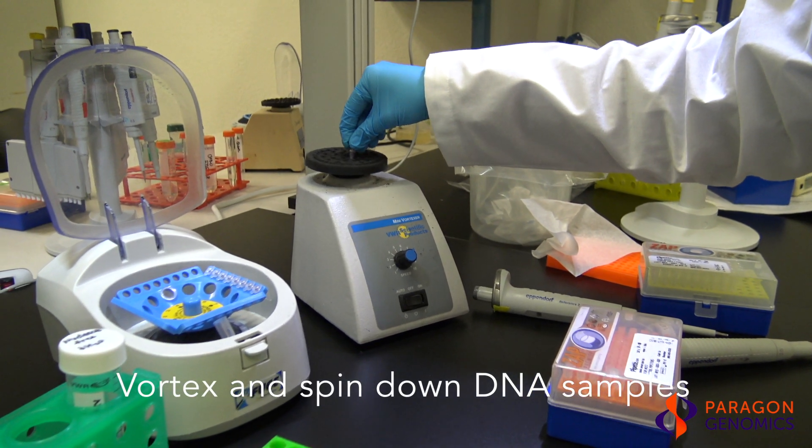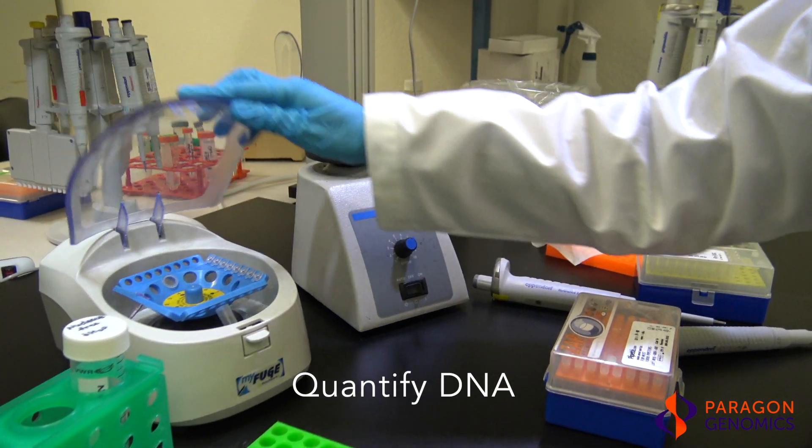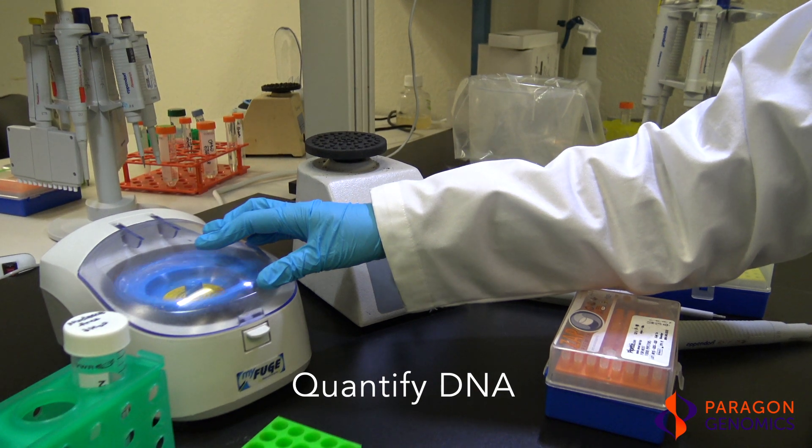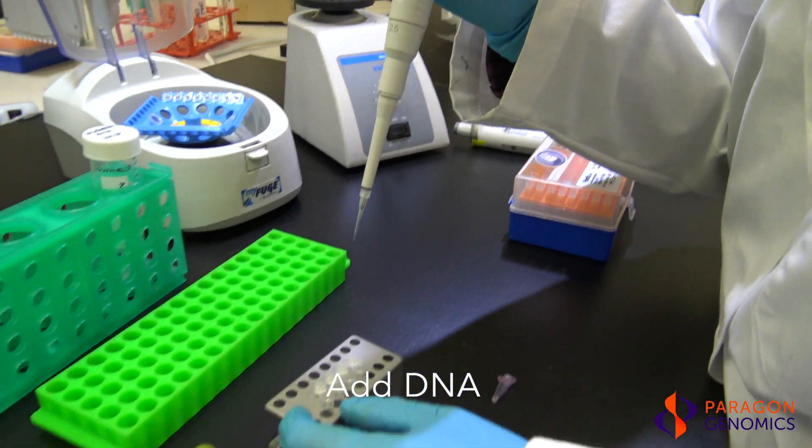Finally, vortex and quickly spin down the DNA samples. Measure DNA concentration with a Qubit dsDNA high sensitivity assay kit. Add the appropriate amount of DNA directly to the solution at the bottom of each tube.